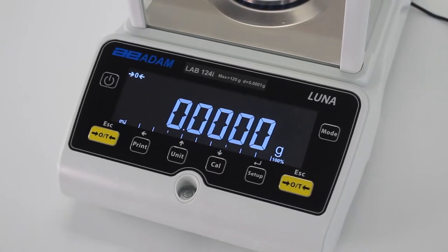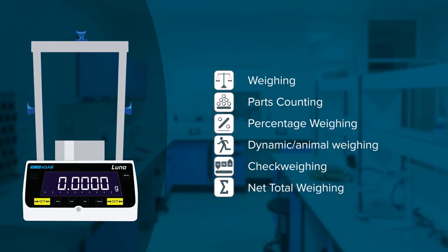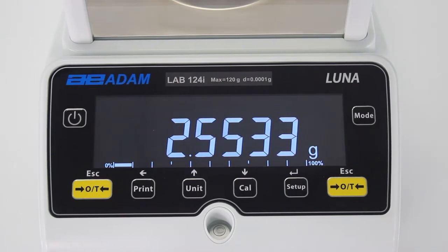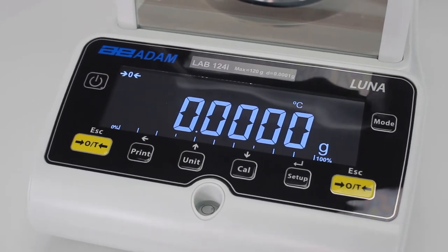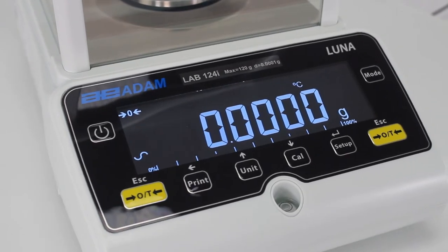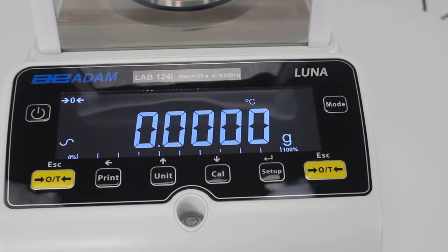In addition to an expansive array of weighing units, LUNA incorporates multiple built-in weighing applications. A generously sized LCD display features large blue digits against a night sky background, allowing you to easily and efficiently discern results. Navigation is simple, with color-coded keys that allow LUNA to almost become a seamless extension of your own hand.